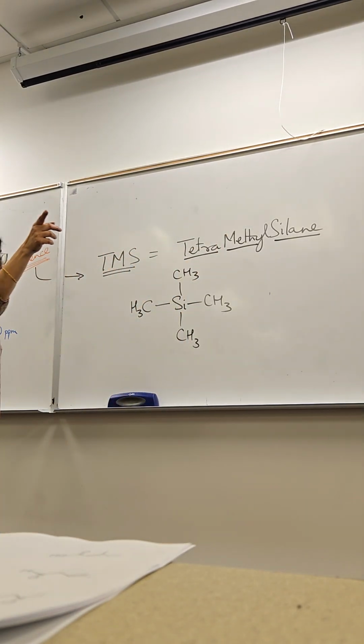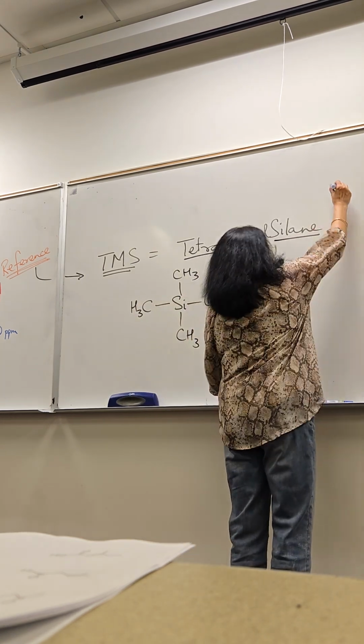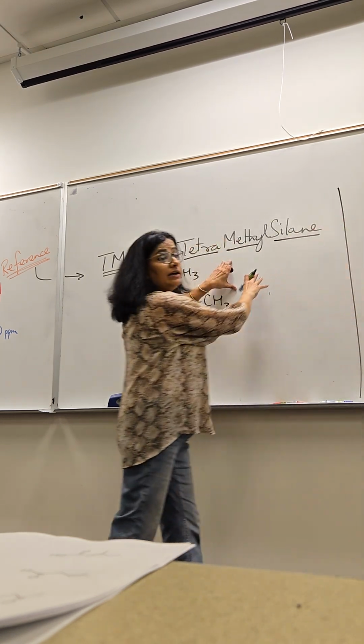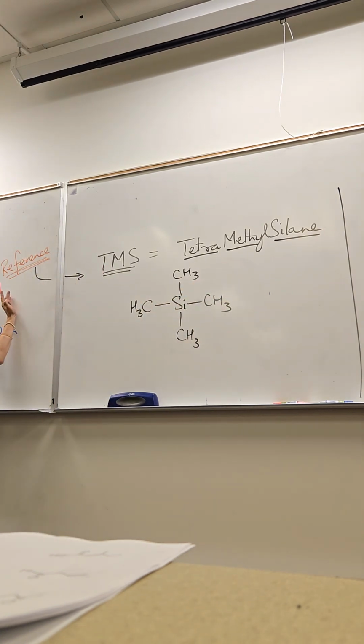Go ahead. I was just going to ask, how does it not detect water? Good, it does. It just does, ignore the spike. But that's why we don't use solvents with hydrogen. So that's your reference, guys. The only purpose of TMS is to mark the 0 point, okay?